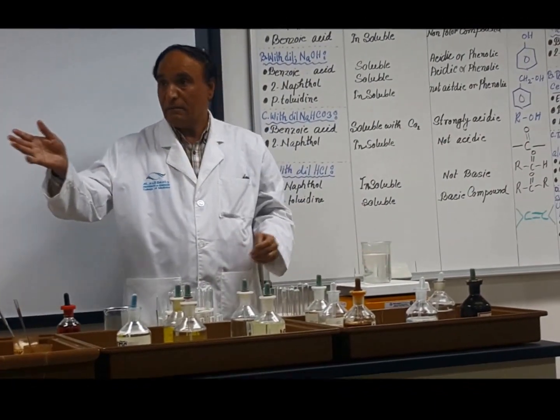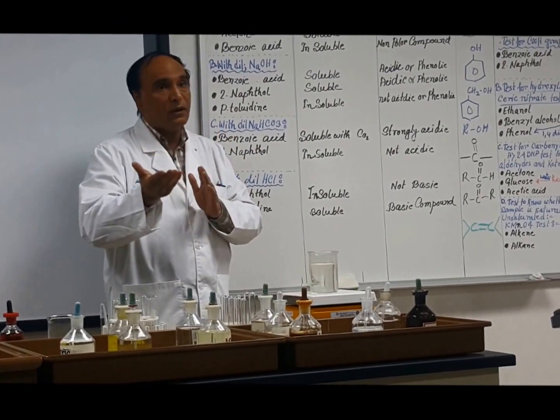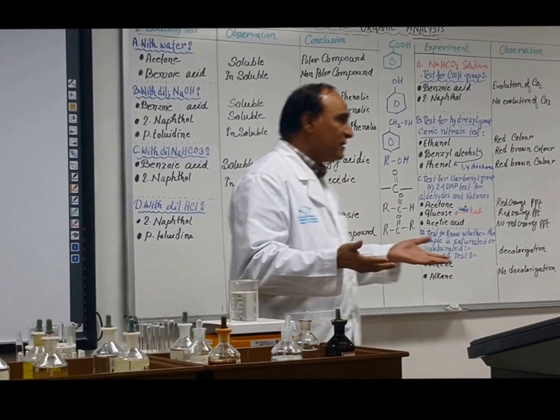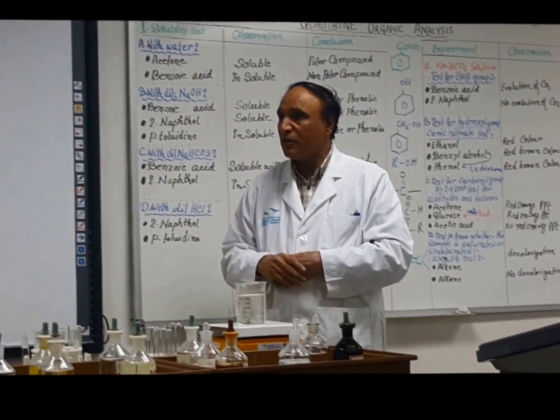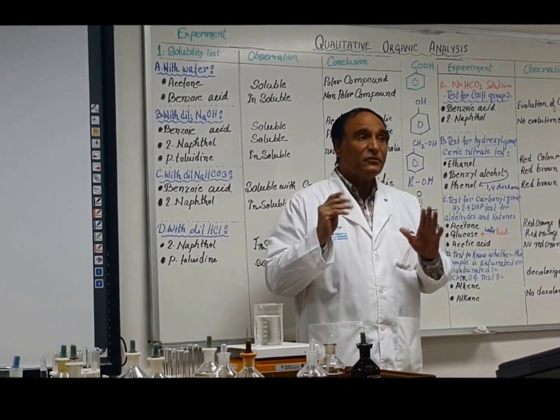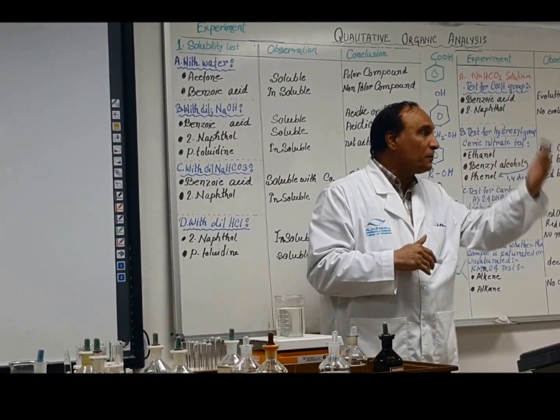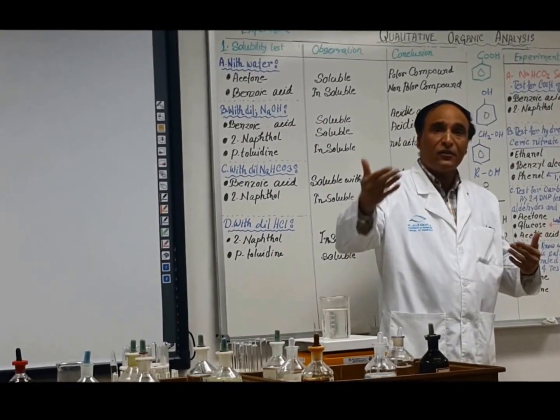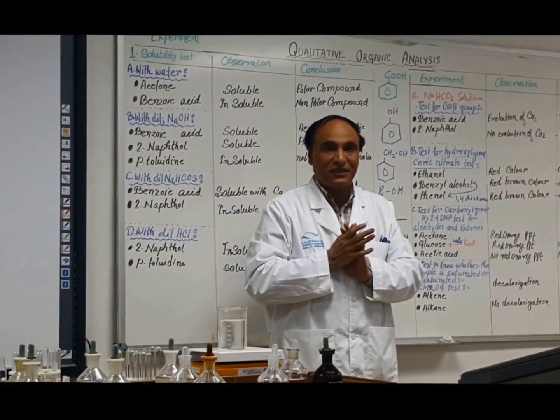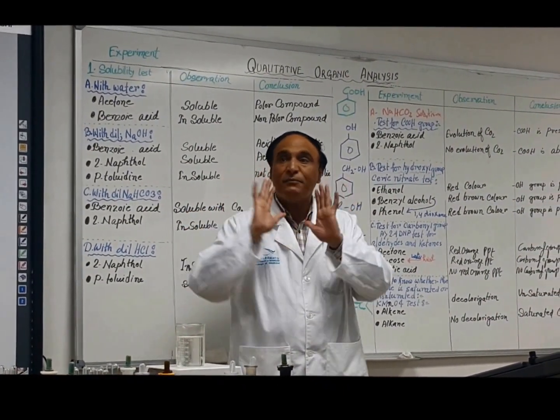then definitely many of you must be thinking, how can we know whether this hydroxy is an alcohol, or whether it is primary alcohol, secondary alcohol, tertiary alcohol? Have you read these things? No, we didn't. Primary, secondary, tertiary alcohol. Did you study in the class? Yeah. Okay. So we have tests to know the test of the primary alcohol, the secondary alcohol, the tertiary alcohol. So we can differentiate. But I am not doing those tests because it's a fundamental lab. I'm just doing major tests.